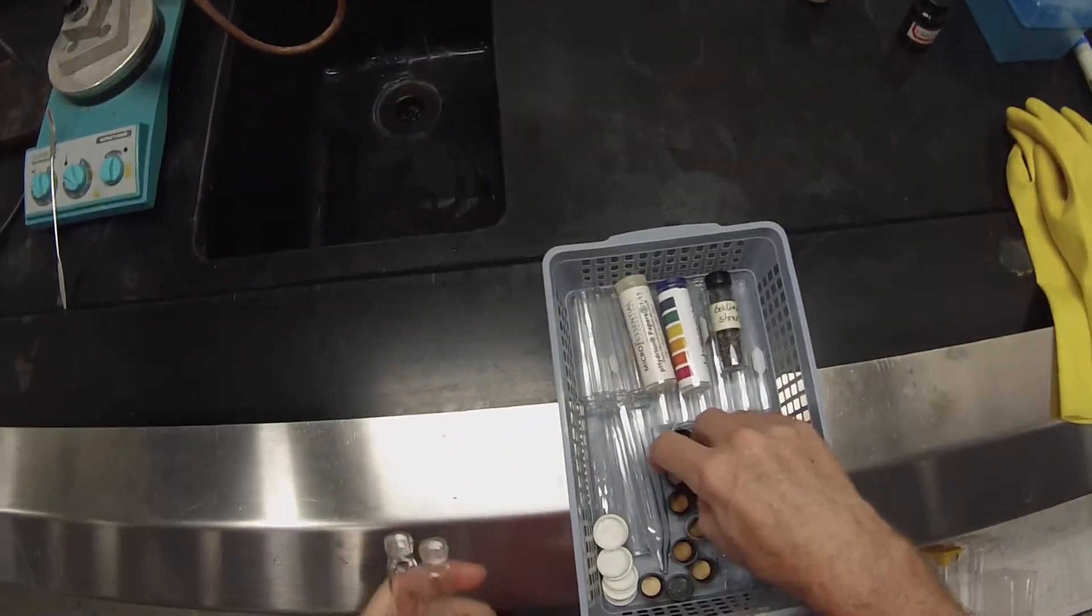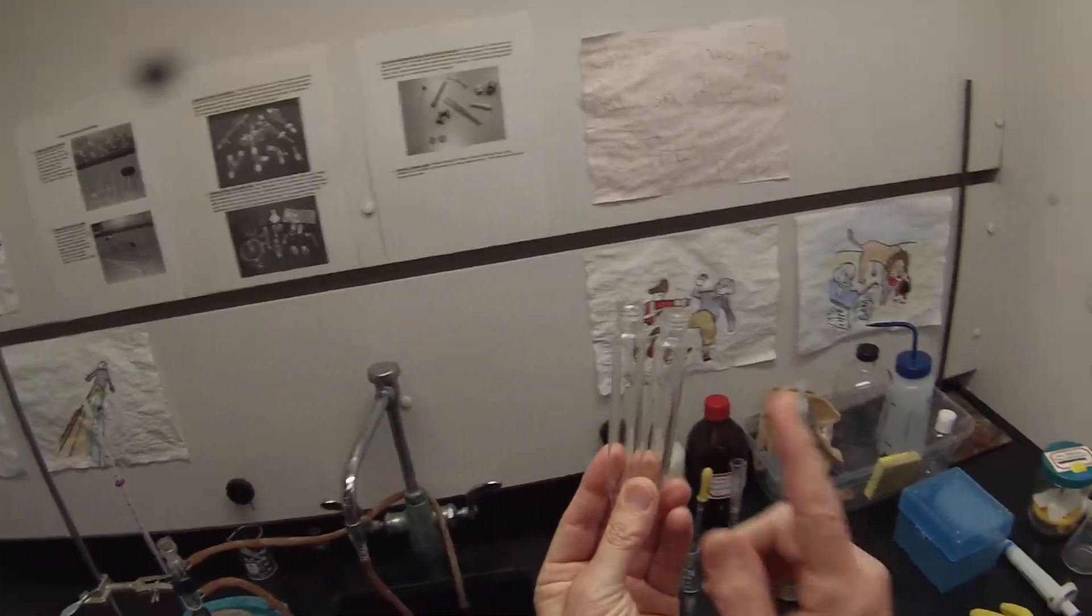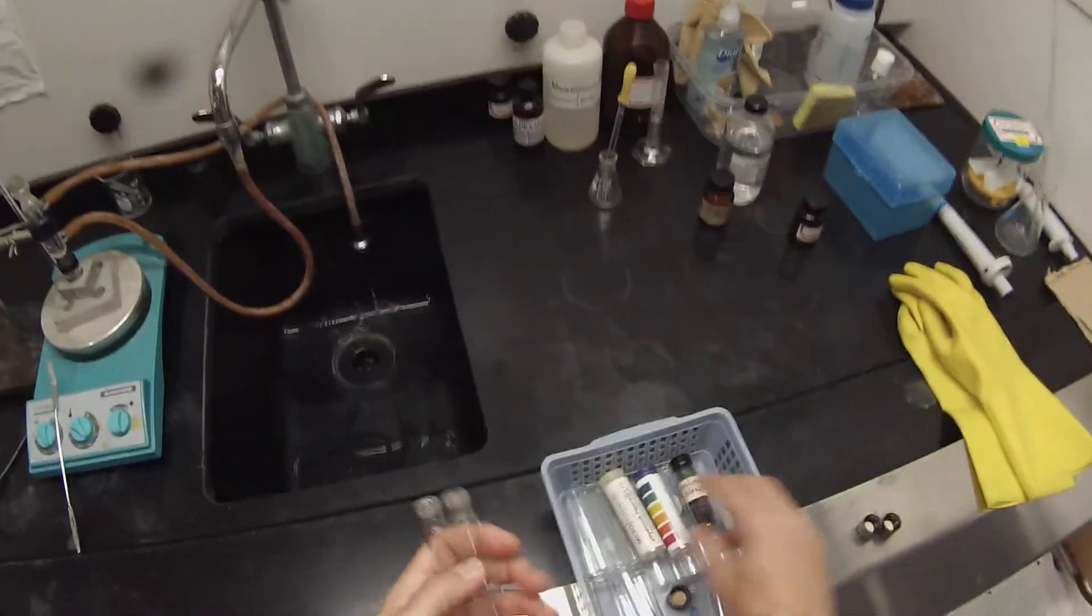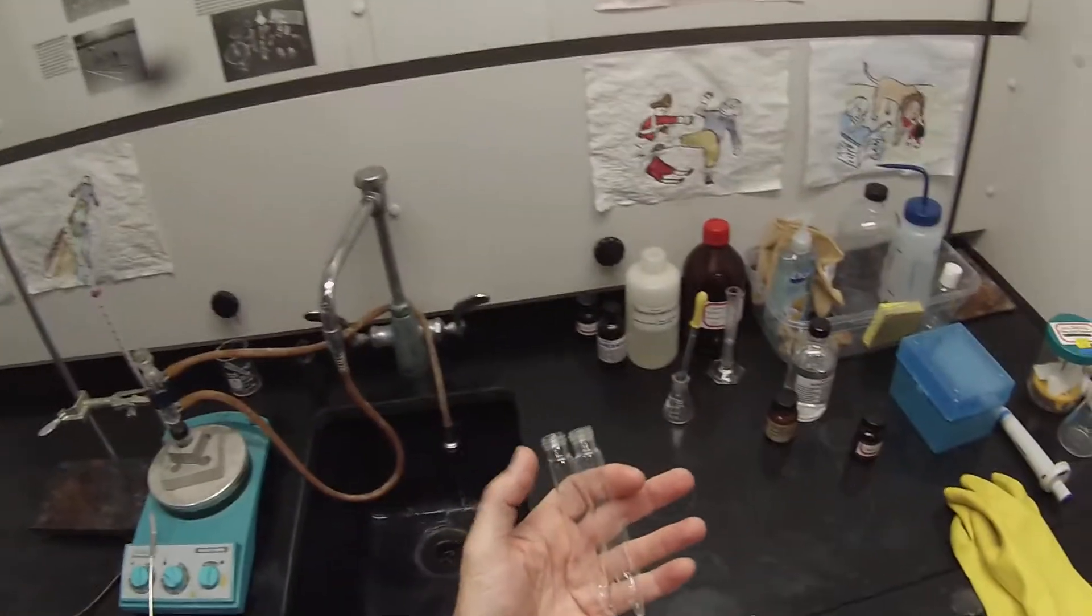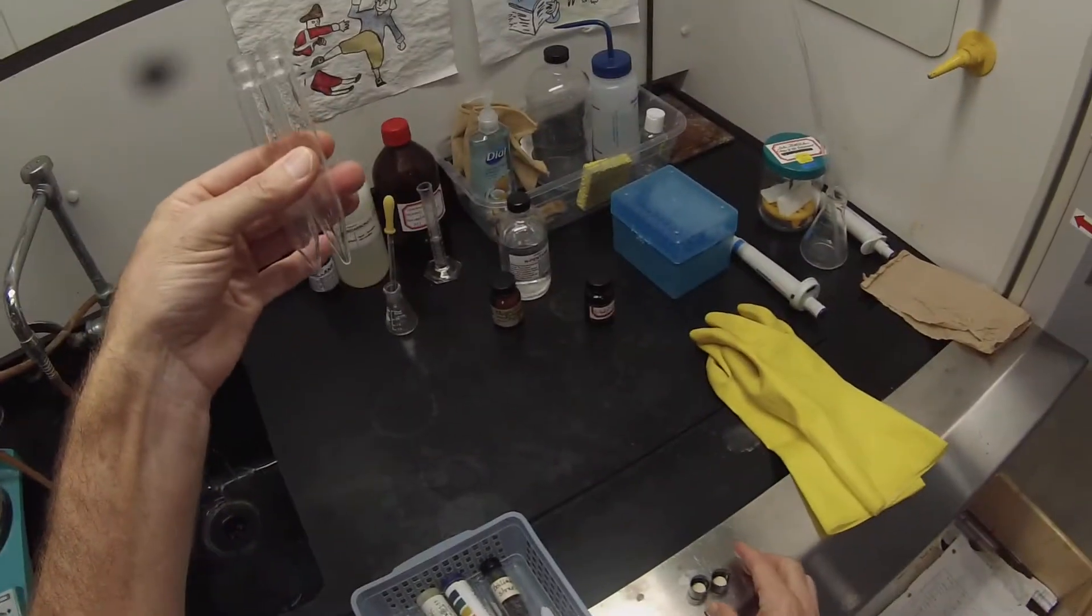But since I have the extra tubes and the extra acid, what I'm going to do is set up two. I'm going to set up one that's just going to go for the 15 seconds. I'm going to set another one where we intentionally let it equilibrate and then we'll analyze that by GC and see what the difference is.